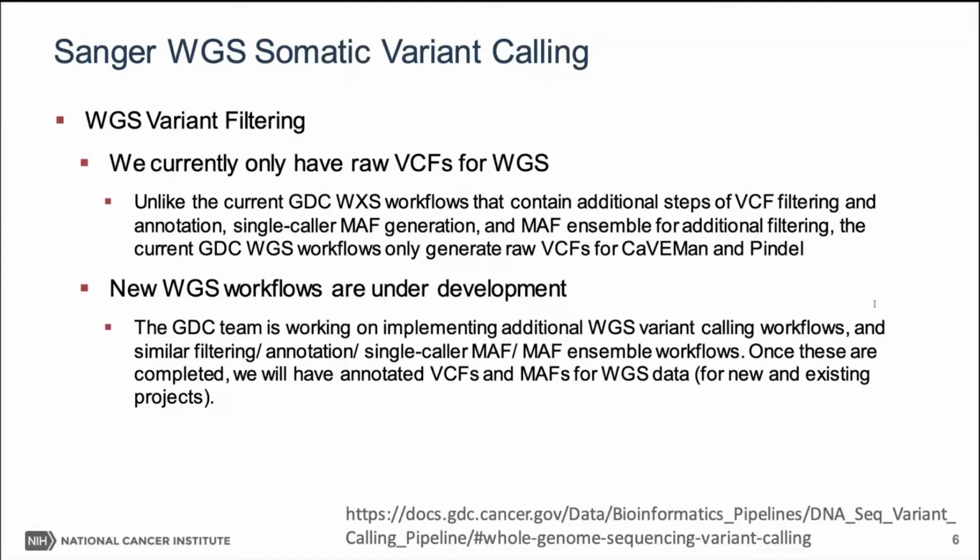and finally we'll have a protected MAF that contains most of the information, and the public MAF that's been extensively filtered, including some strategies like we require the variant be called by at least 2 callers. So the final masked ensemble MAF is the one of the best quality and what we expect users to use.